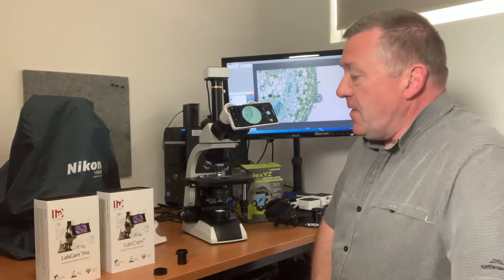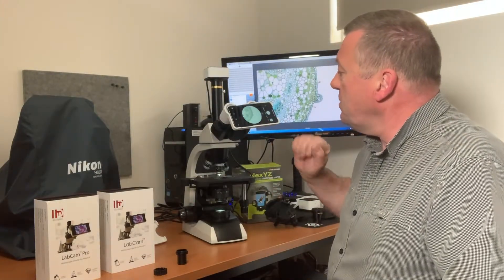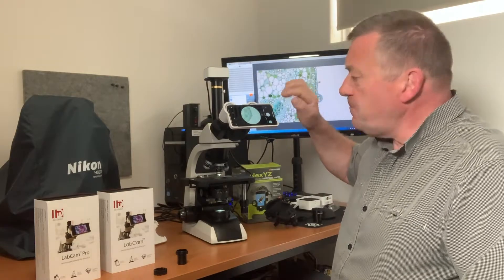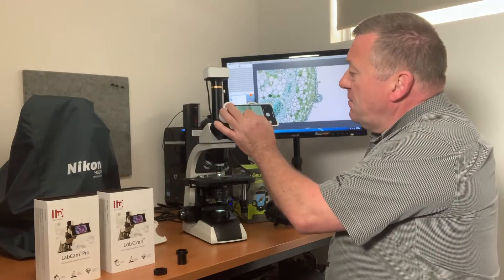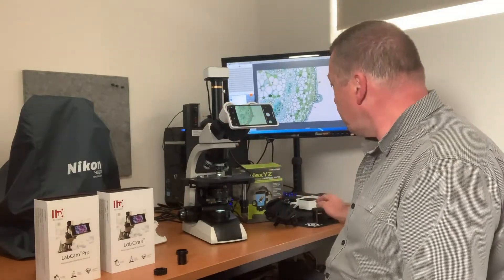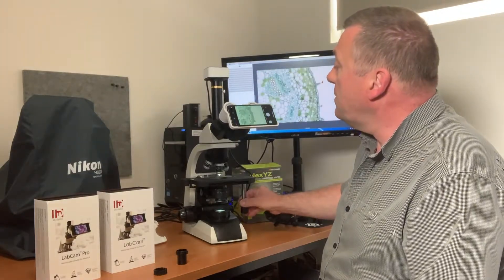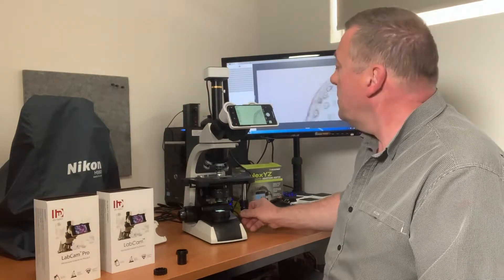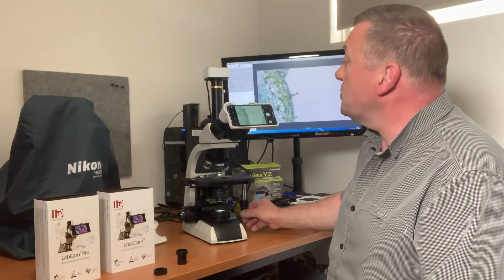The difference between the original and the Pro version is that on the original — which I've got fitted at the moment — it has a smaller field of view; you can see the whole circle of the eyepiece. You can zoom in and control the specimen by looking through it on your camera and adjusting the stage.